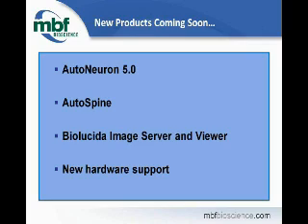Biolucida is something that I've been working on since I started with the company 5 years ago, and so I'm just so ecstatic that it's now getting to the point where it's going to be released and people can start using it. Biolucida is an image server and viewer.